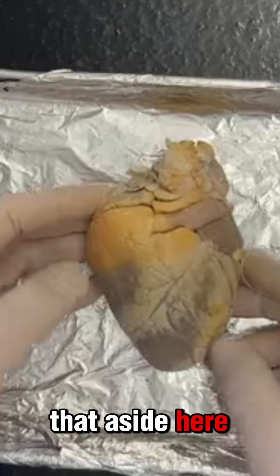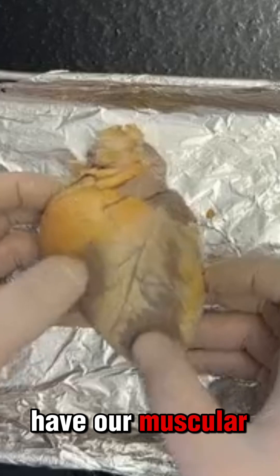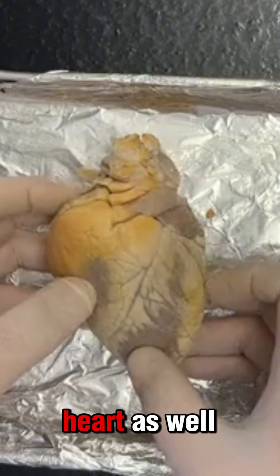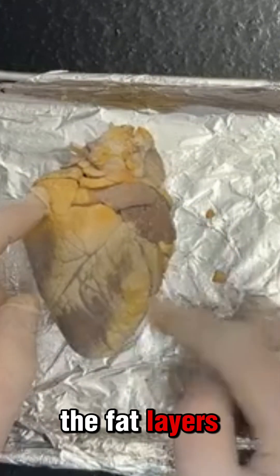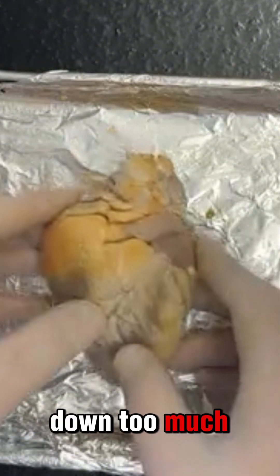I'm going to toss that aside. Here we can see some fat areas on our heart and then we have our muscular areas as well. The fat layers protect the heart from the pericardium so it doesn't wear down too much.